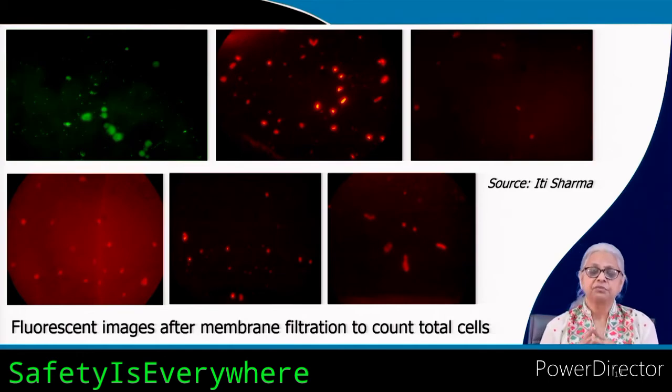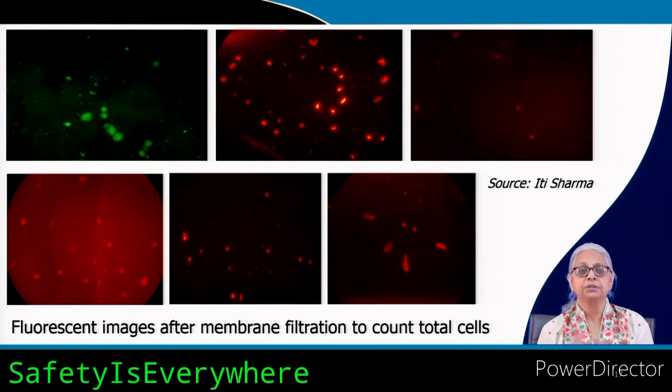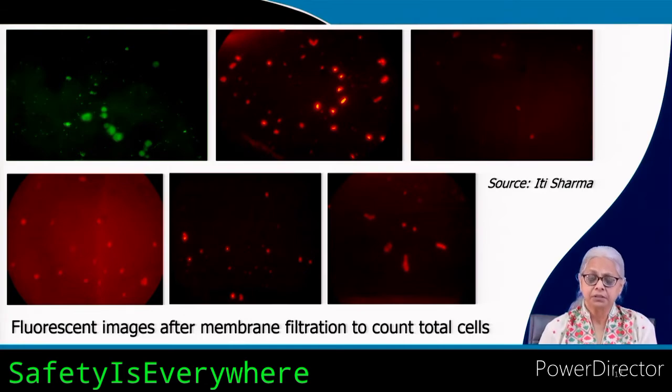So the very first 5 minutes is when you can do some useful work with this dye, and that's why having a camera and a PC is very important, because then you can capture the images in the very first 5 minutes and then count the number of bacteria when you get time. So this is useful for enumerating bacteria and for storing images on either a PC or any other device.